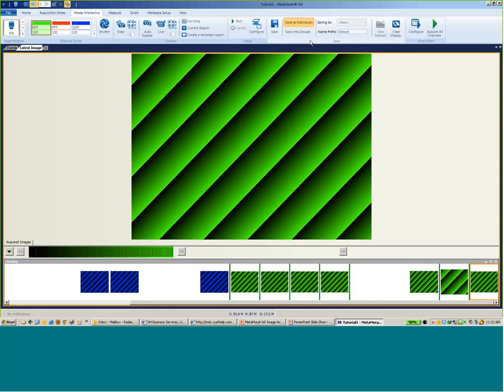So high-speed acquisition. Again, left to right workflow, we set up the exposure time, the magnification setting we wanted to use, the illumination that we're doing. This is where we set the exposure time for that illumination. You can do a live or a quick snap just to look at the pictures, make sure things are focused and so forth. You set your camera area you're working with. Then you set the number of time points, which is the number of frames you want to acquire in this case.